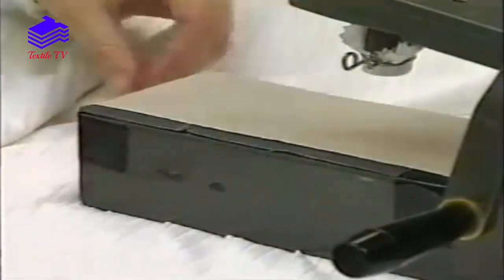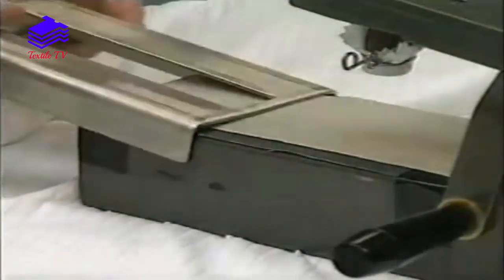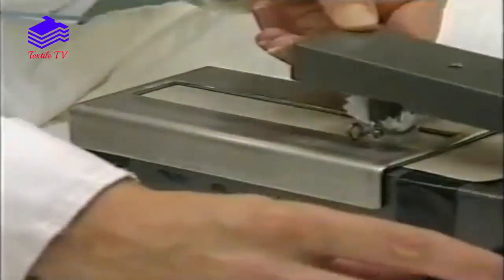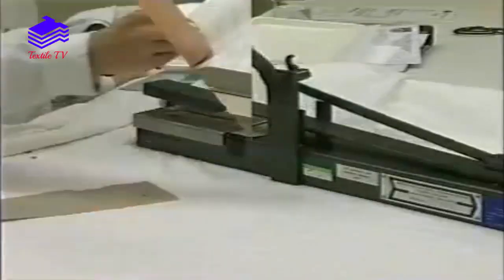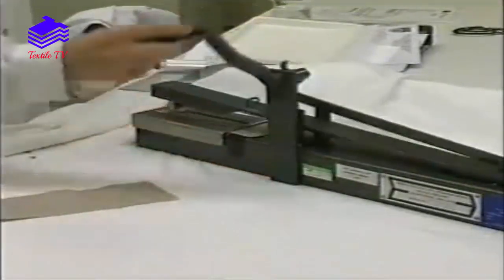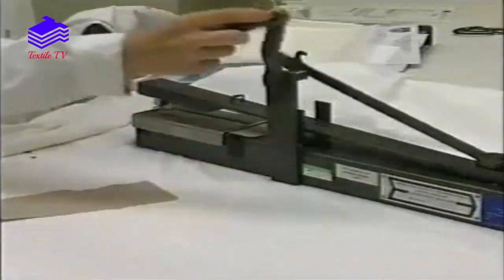The test specimen is clamped on the base of the crockmeter. The top unit is lowered onto the test specimen and the handle rotated to produce a rubbing action of the covered peg against the test specimen.